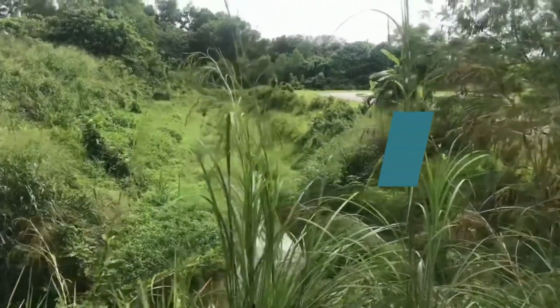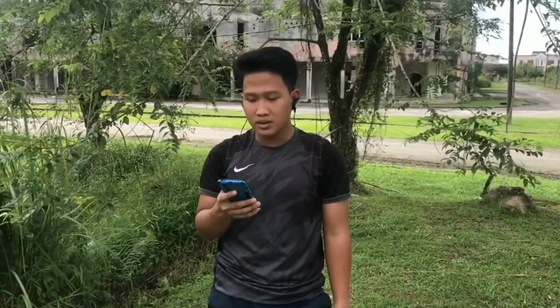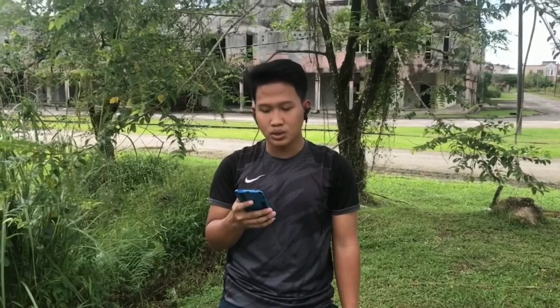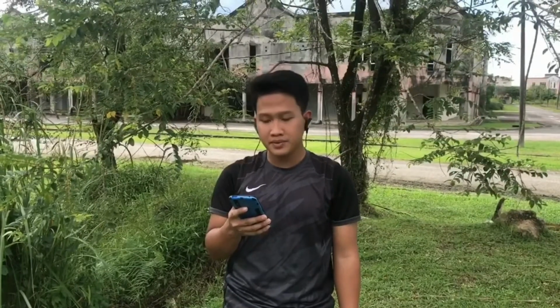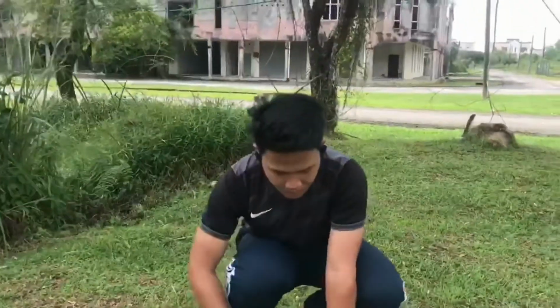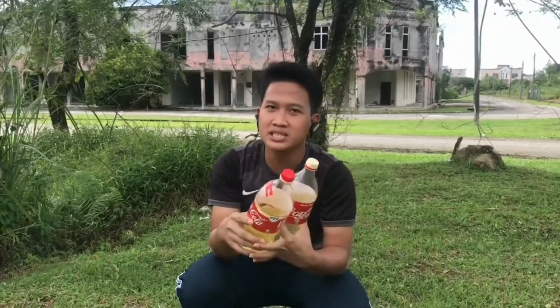Step number 1. Obtain a water sample from any source you intend to test for its biochemical oxygen demand, BOD. Each sample should consist of 2 sets of bottles. One set of bottles will be tested on day 1. The second set of bottles will be stored for 5 days. So, these 2 bottles of water samples I had collected from this stream.